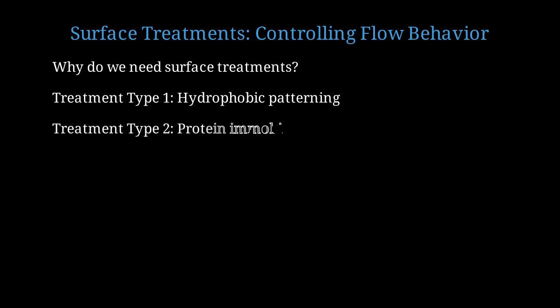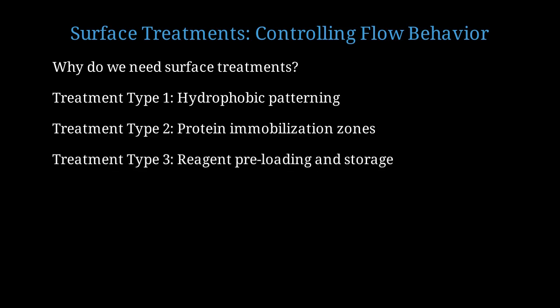We can create zones where capture antibodies or enzymes are immobilized. These zones catch specific target molecules from the sample. Reagents can be dried into the paper matrix. When sample fluid arrives, these reagents dissolve and react, enabling complex assays without user intervention.